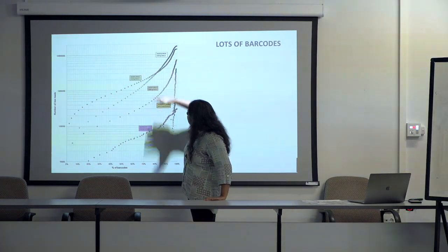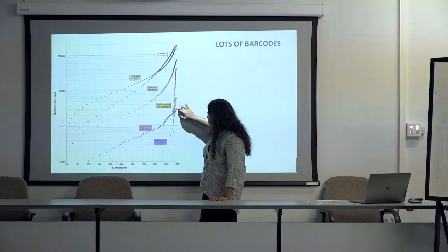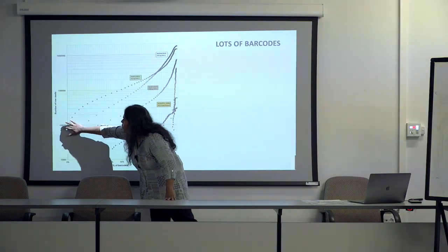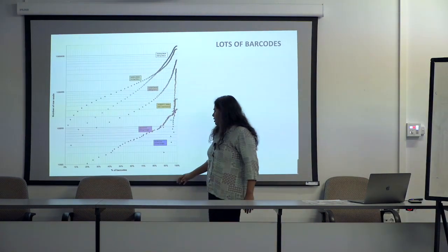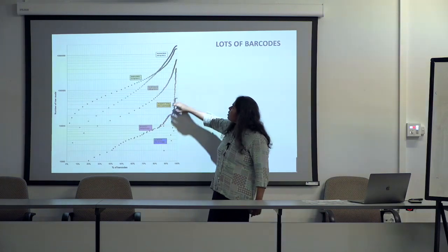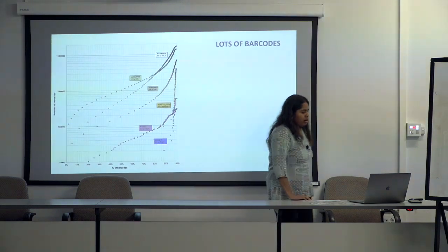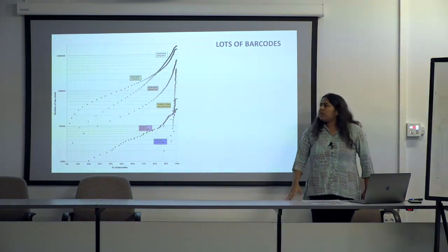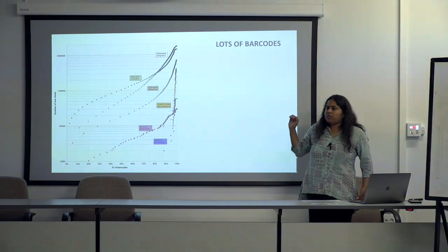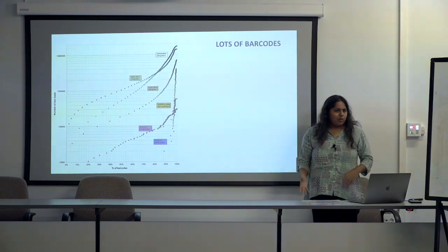So this is the coverage assessment. Basically how much data you need for how many barcodes. The two runs here are the Flongle runs. And this generated somewhere about 200,000 to 300,000 reads. And we could get something like 200 or 250 barcodes with Flongles. And we could go up to nearly sequencing 8,500 for a full MinION run. We subsequently, internally in the lab, were able to hit 13,000 or so. So that's where we would usually sequence by the time that many products were available.